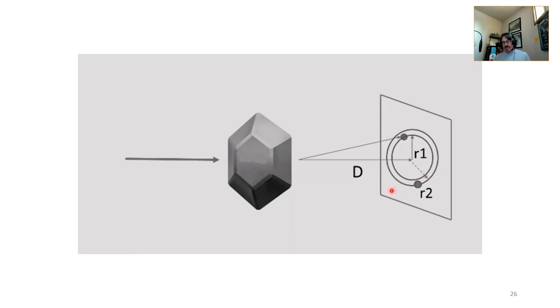The d-spacing of the first order is always going to be greater than the second order and so forth. So as the rings go out, your d-spacing is actually decreasing. So don't forget that. We'll bear that more in mind when we deal with electron diffraction.